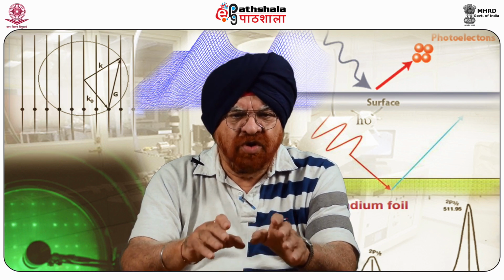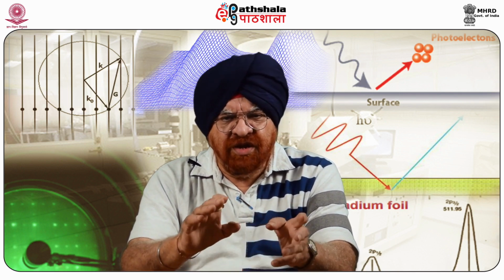In this model, the incident electron has to be scattered in the region above the surface. It does not come to a direct impact at the surface, and as the amount of momentum transferred is small, the scattering results very much in the specular direction.